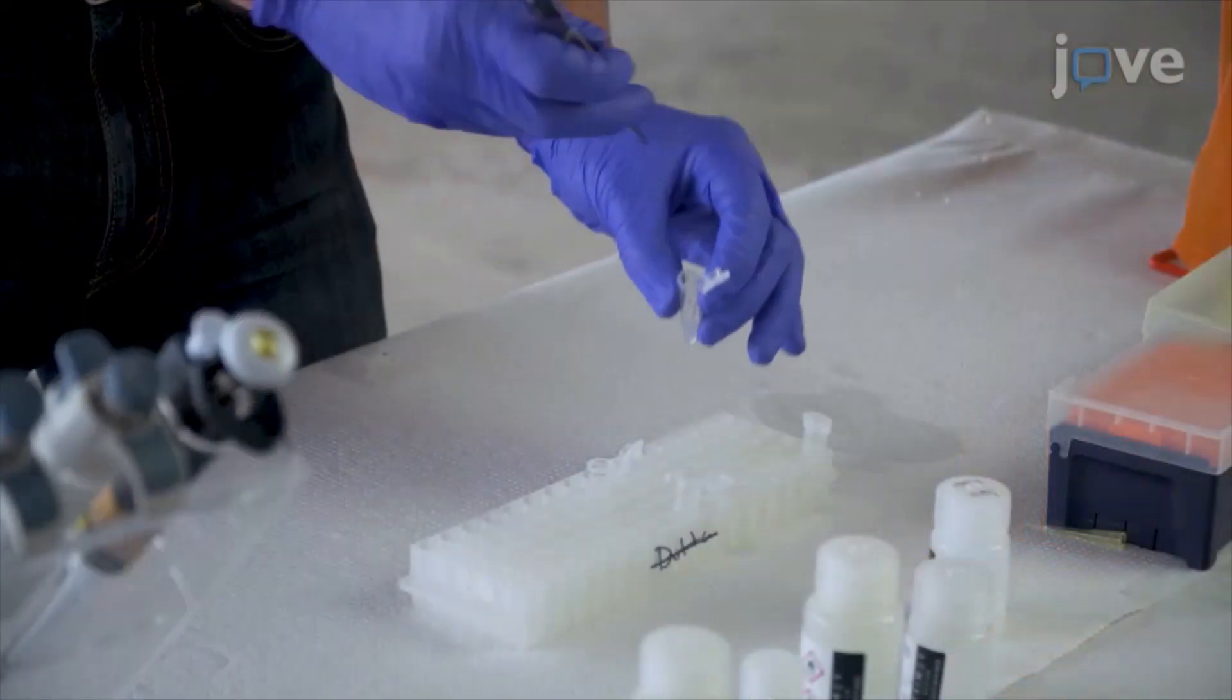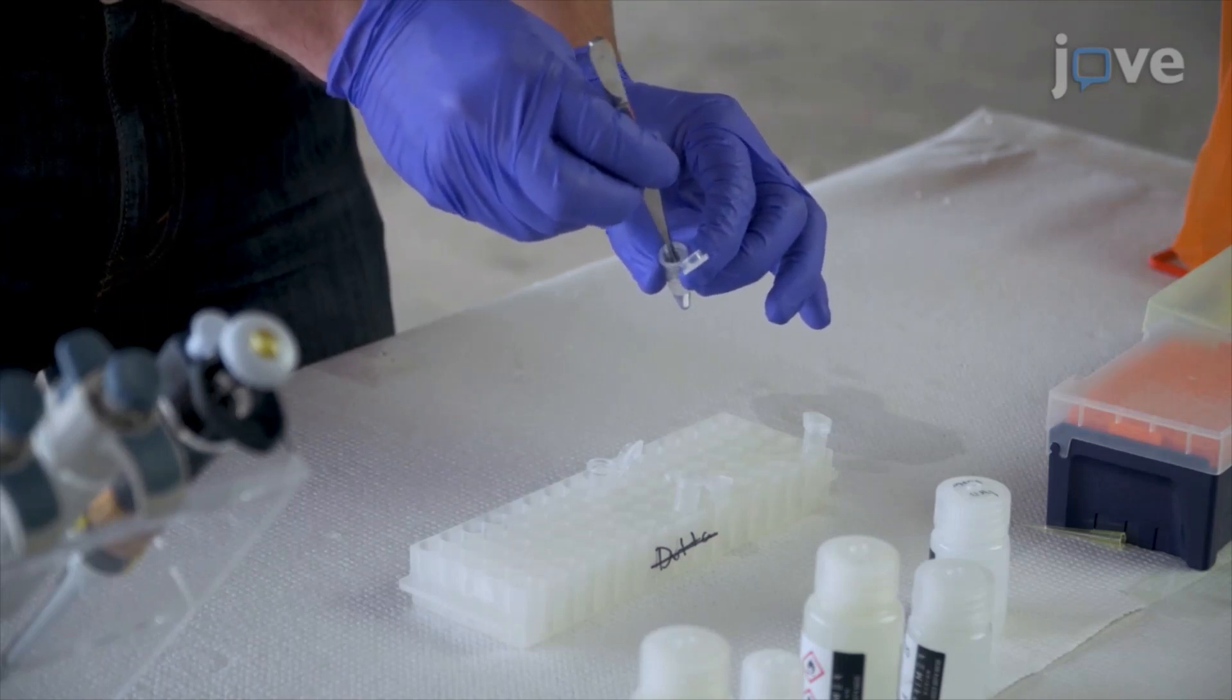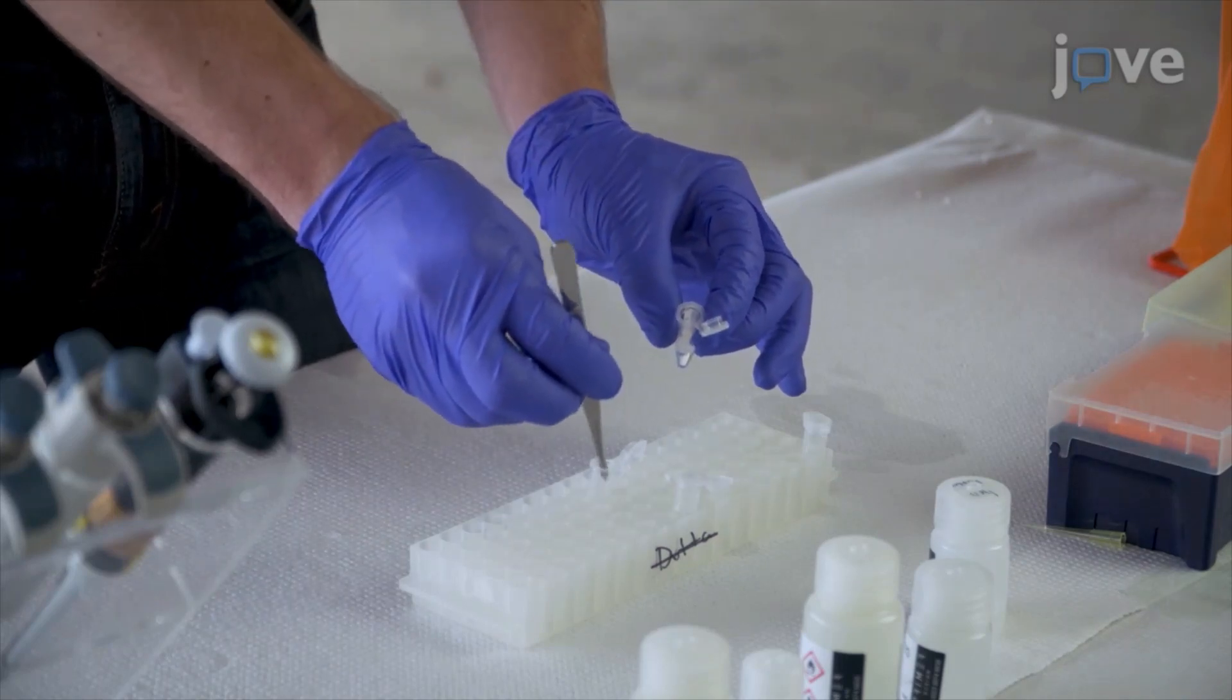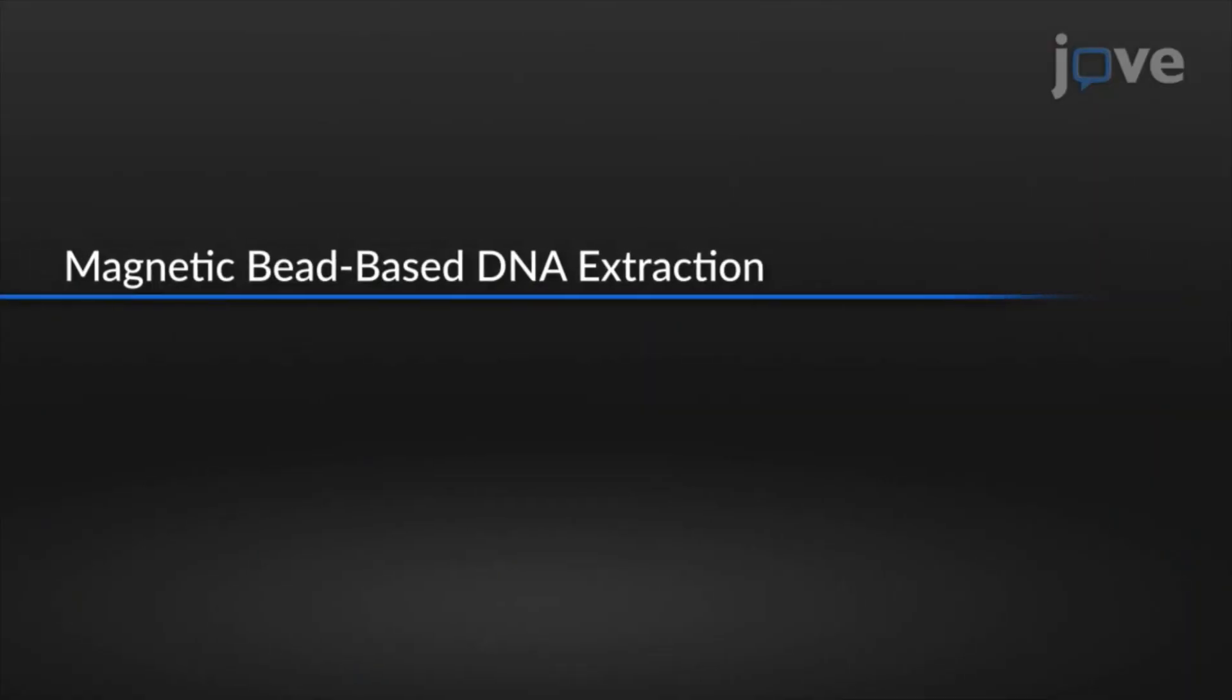At the end of the incubation, use forceps to remove the paper with as little buffer as possible and repeat the lysis with the next set of filter paper pieces.